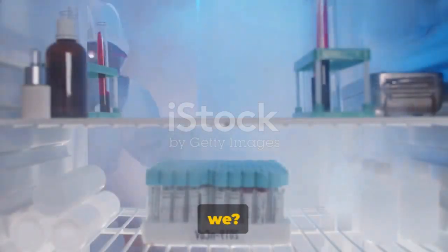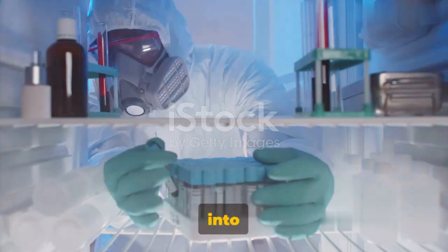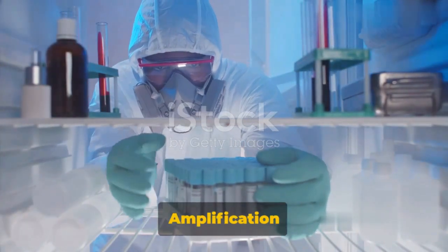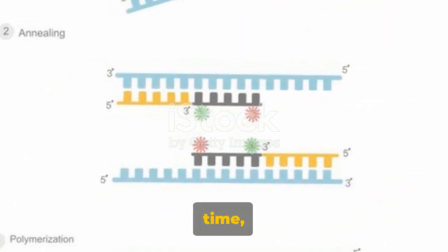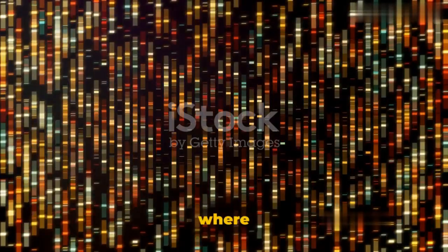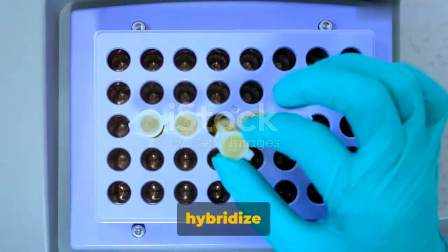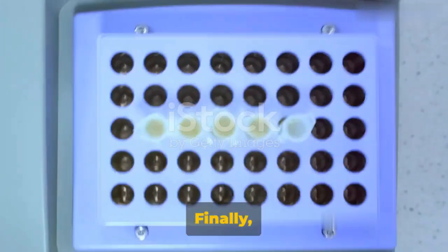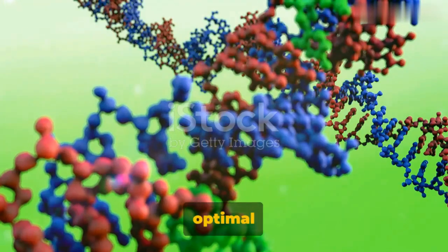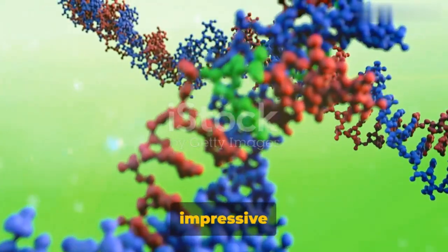We've come a long way, haven't we? From understanding the intricacies of real-time PCR to delving into its two critical steps, amplification and detection. We've seen how amplification is a dance of temperature and time, beginning with denaturation, where DNA is melted into single strands at high temperatures. Then comes annealing, where complementary sequences hybridize at a temperature just below the melting point of the primers. Finally, extension happens at optimal DNA polymerase activity, leading to primer extension at impressive rates.